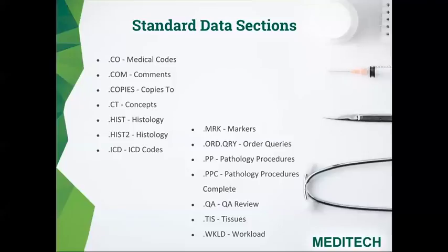and also you can define additional procedures based on the blocks and the levels that you have been creating through this data section. So basically, it has similar functionality as the .hist, but it provides greater detail.